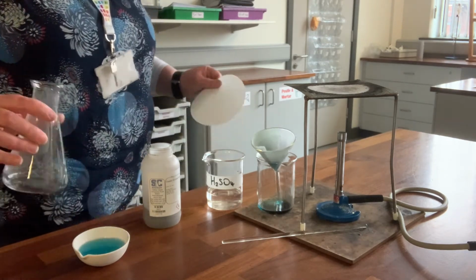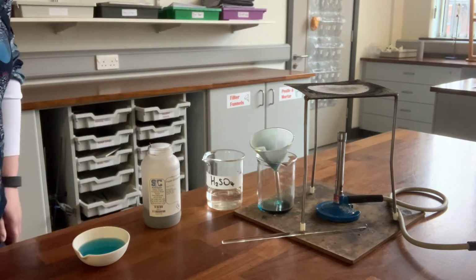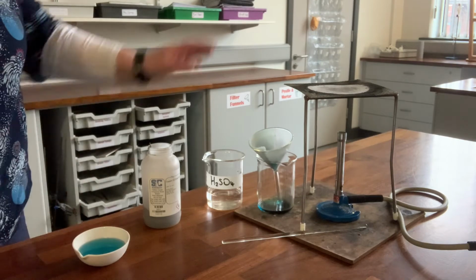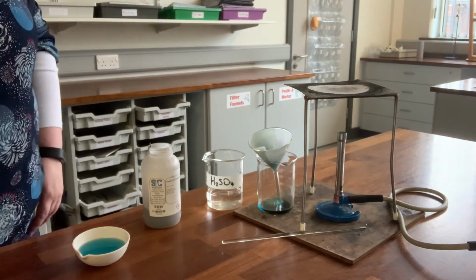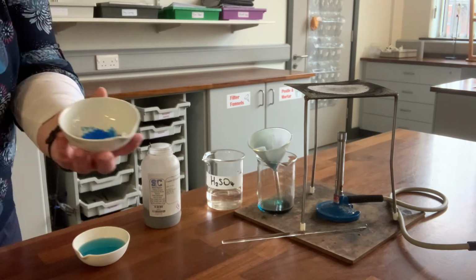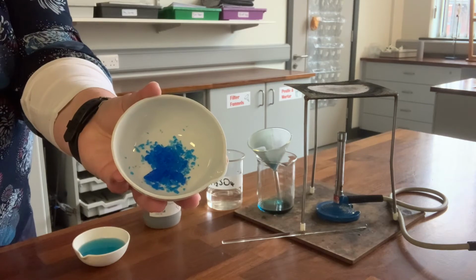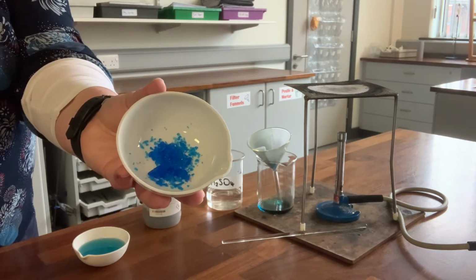So we've got our copper sulfate solution in an evaporating basin, and we will leave it. We can either leave it on the windowsill for a few days to evaporate off the water, or we could put it on top of a water bath and evaporate it quicker on the Bunsen burner. And when it evaporates off, we will get some copper sulfate crystals left behind. So the water evaporates off and we're left with the copper sulfate crystals.